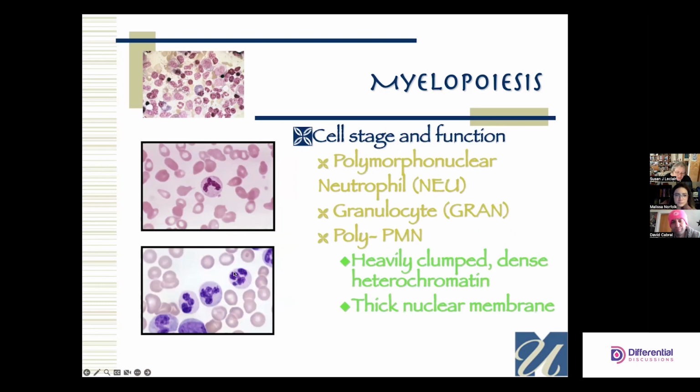They're dark. It doesn't make any difference then when you look at this cell, say, well, there's no visible segment. True. Look at the chromatin in this cell and this cell and this cell and tell me if they're different. They're not.